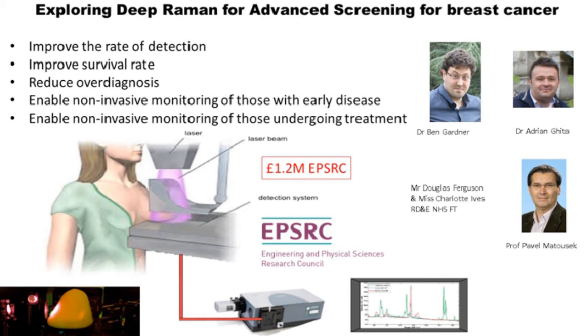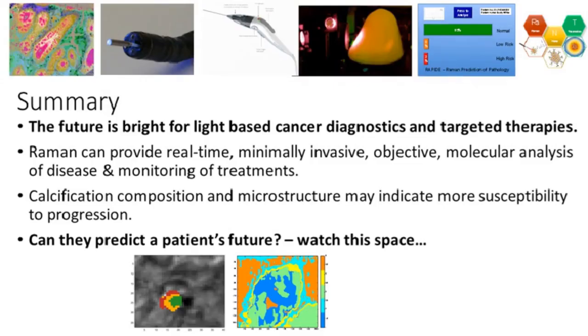much light as possible. So what we do is we fill our spectrometer to the max, we open up the slits, we use a high dispersion grating, and we want a camera that's able to measure as many of our fibers or as many of our beam as possible to maximize the signature that we're able to measure. So all of those studies are ongoing. We have 3 first-in-human studies funded and ongoing, as I mentioned.